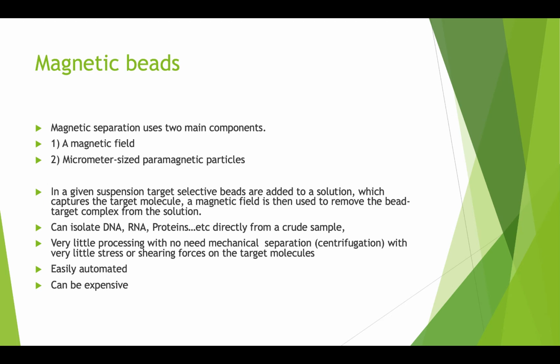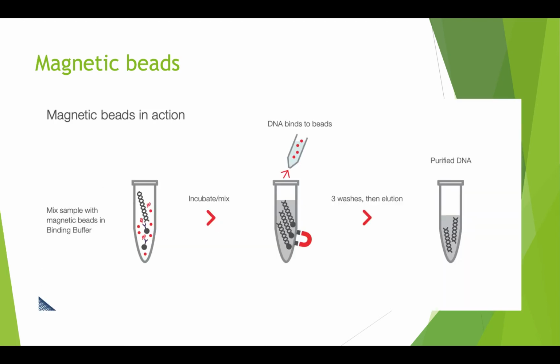The less dependent the technology is on the user, the better, and this is less user dependent. That's the method. You put the DNA and the red base, you put these black circles which are the magnetic beads. They will come and bind the DNA. You put your magnetic field and then pull it up, and then everything else you can leave, you can put the field and leave it in the tube and then decant everything else, you throw away everything else. It depends.